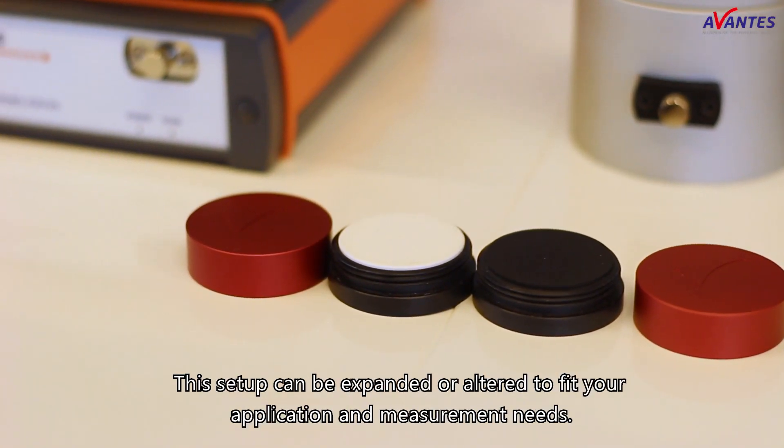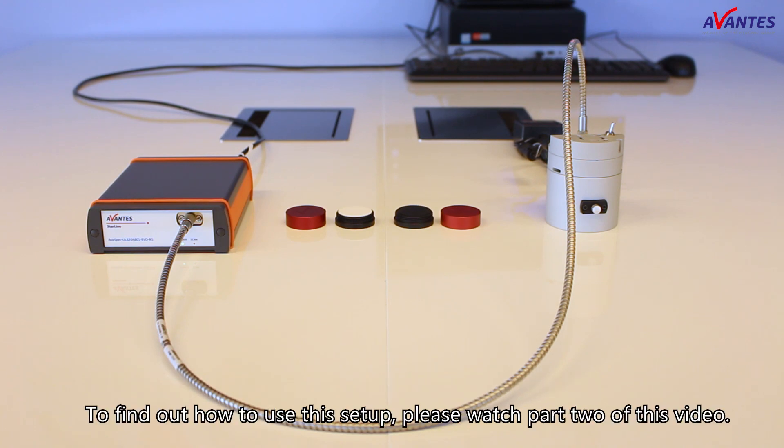This setup can be expanded or altered to fit your application and measurement needs. To find out how to use this setup, please watch part 2 of this video.